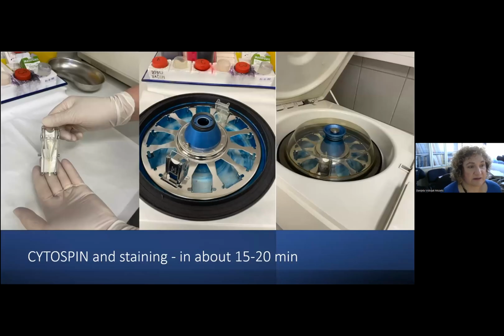So this is how it looks. We use cytospin, and this first-line staining I usually compare with ROSE, but it is not on site, because it is a fast evaluation of the material in order to process it while it is fresh.